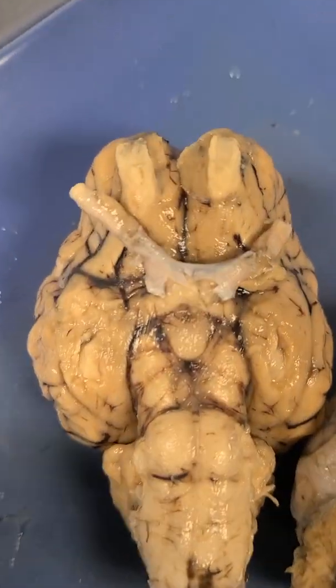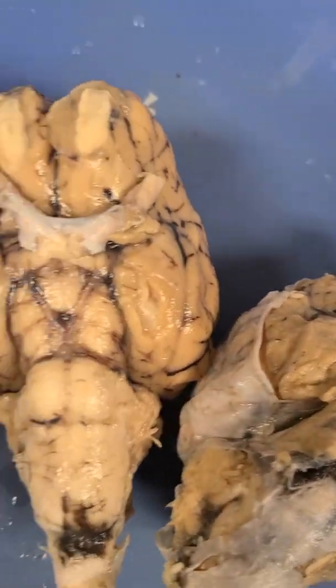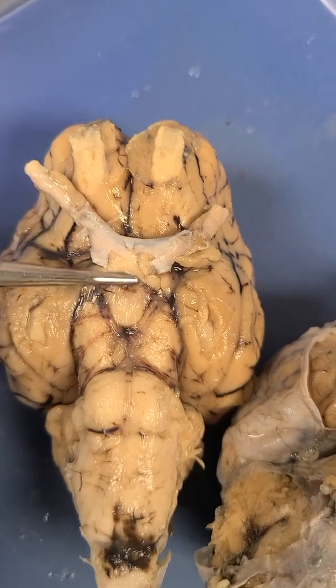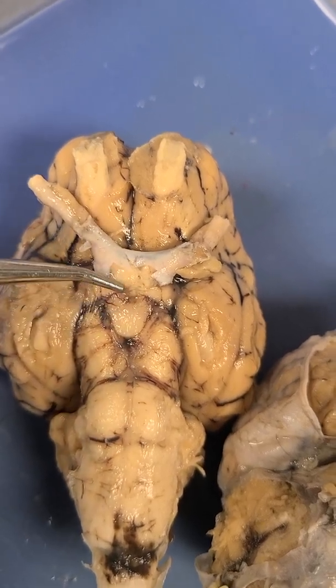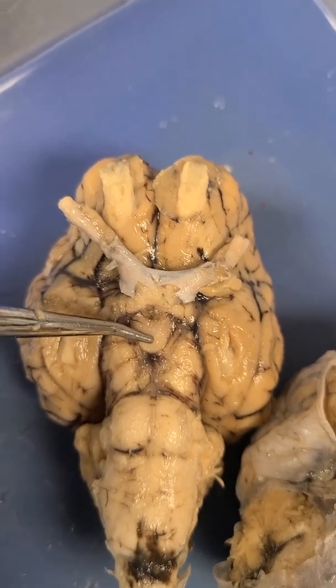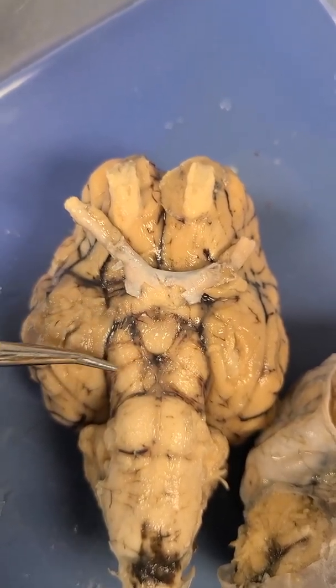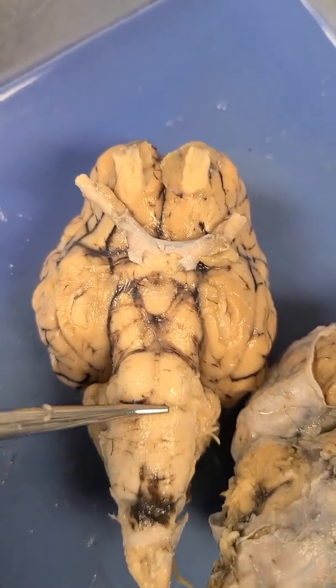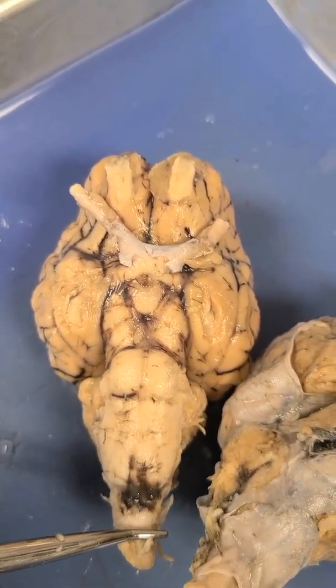Okay, I'm going to do this side again. These are olfactory bulbs, optic nerve, optic chiasm. We're calling this the infundibulum, the mammillary bodies, the cerebral peduncles, the pons, the medulla oblongata, and the spinal cord.